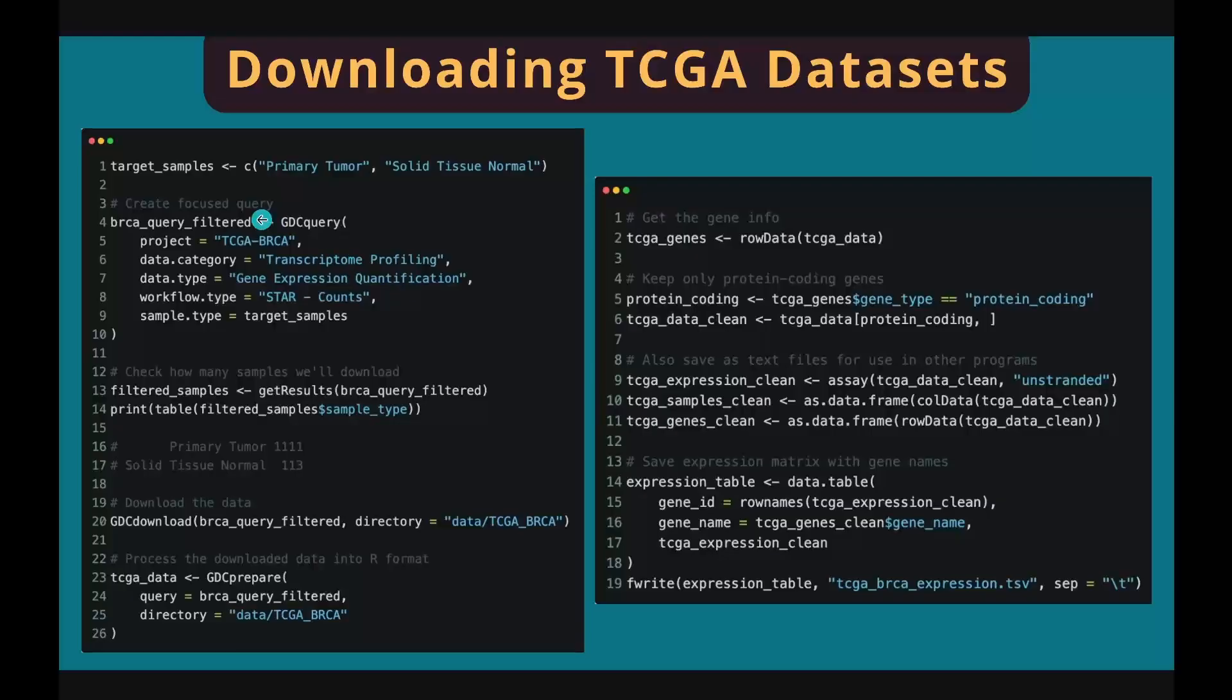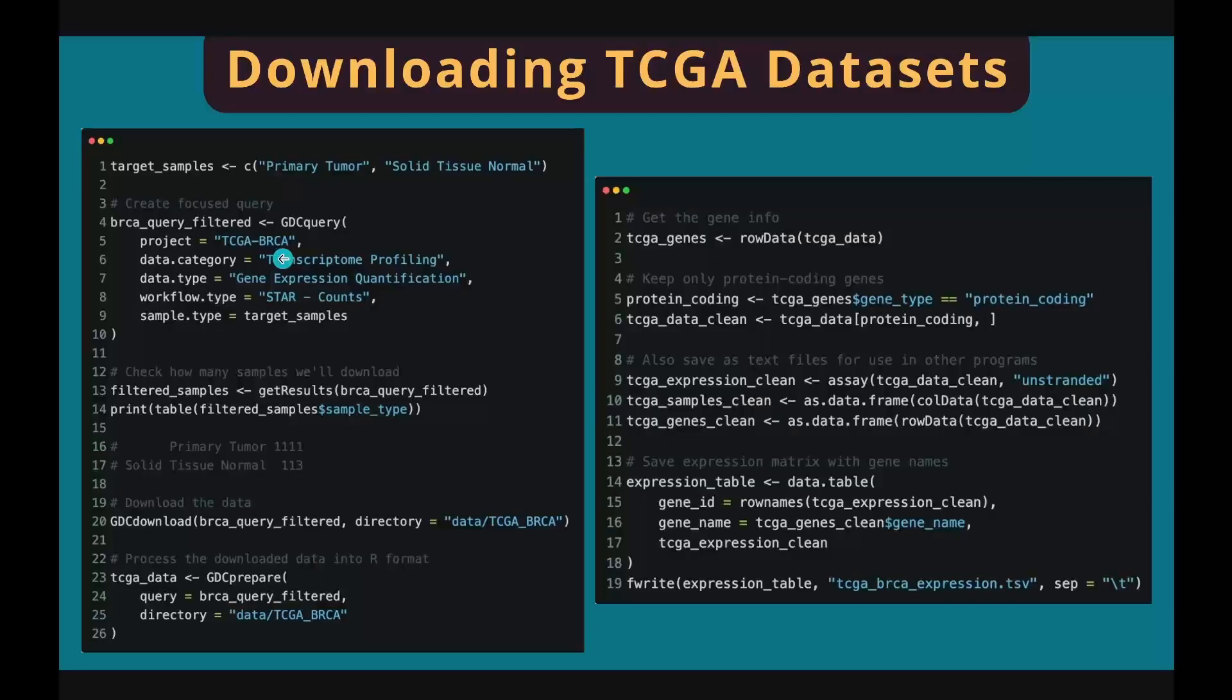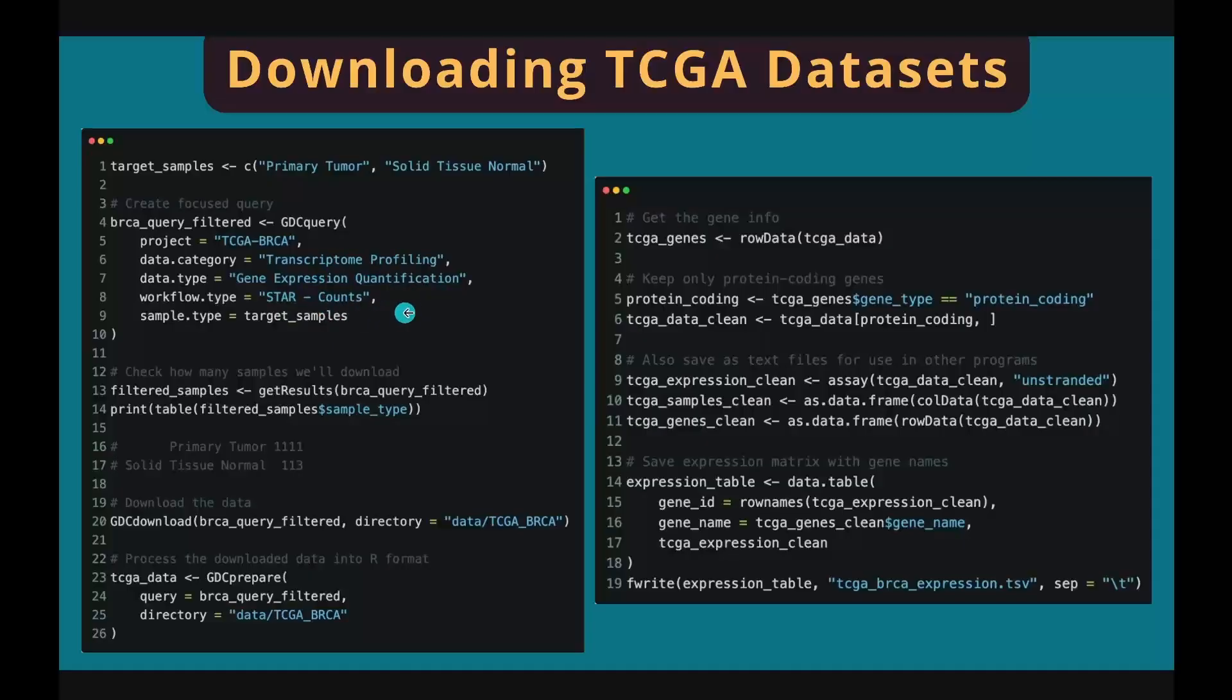First, we create a focused query using the GDCquery function. In this function, specify the name of the dataset you want to download. Here we want TCGA-BRCA dataset. Data category, we want transcriptome profiling. Data type, we need gene expression data. Workflow, we want raw counts, not normalized counts or FPKM. Sample type, we want primary tumor and solid tissue normal.